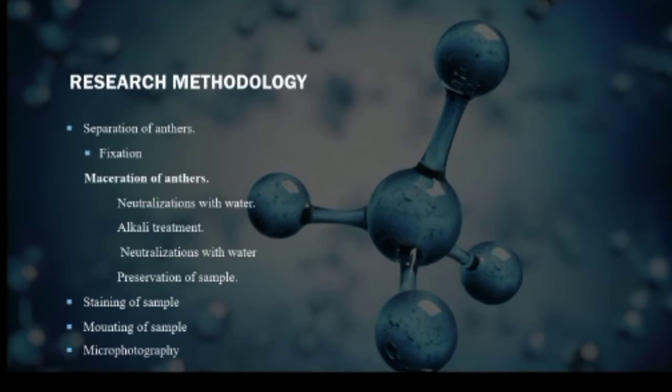Then again the neutralization with water was carried out, and the sample was preserved in the 1% thiomersal solution. Staining of the sample was performed in the safranine, and mounting of the sample was performed on the clean glass slides, and glass slides and cover slips were cleaned with the ethanol, and microphotography was performed with the MIGI trinocular microscope at the high resolution power, that is X60 and X40.